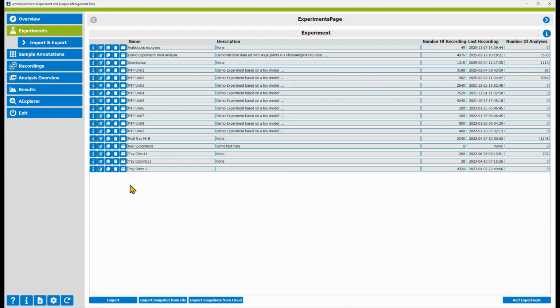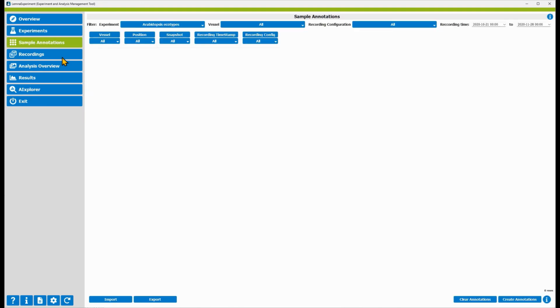In the manual case, you can annotate only snapshots that have already been recorded. If they are already analyzed, then the system may have created them automatically, as I have described before. You may now modify them as needed.